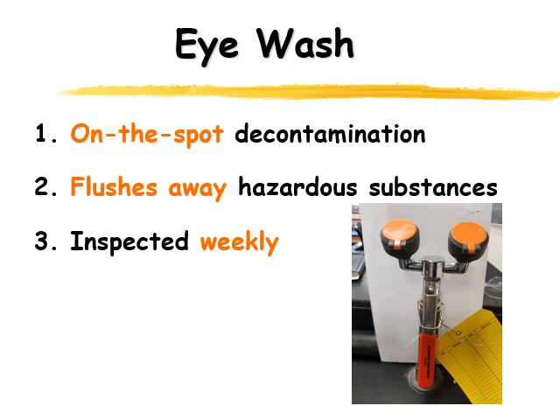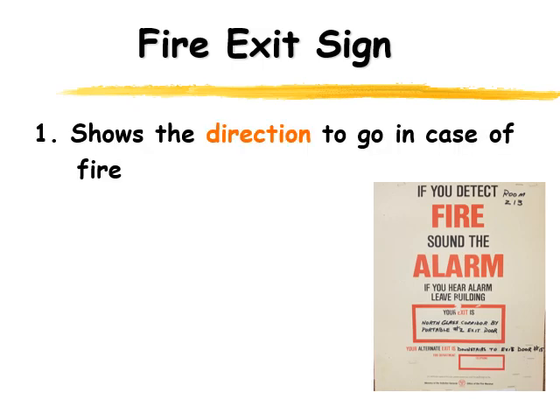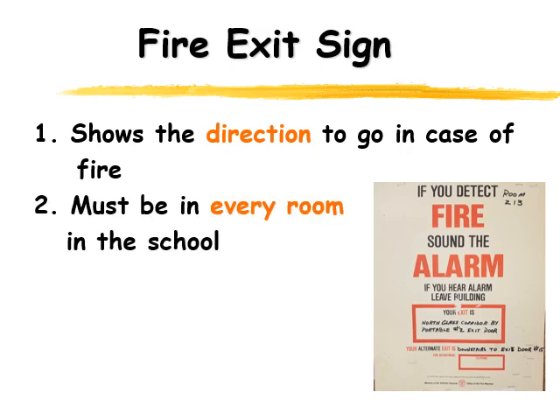You may notice in all classrooms there's a fire exit sign, and on the fire exit sign it tells you where to go if there is a fire alarm. They show you the direction to go in case of a fire — and there may not even be a fire, it may just be the fire alarm going off for some reason. By law, every classroom has to have one of these to show you how to get out of the school, and those are inspected regularly to make sure they're as up to date as possible.